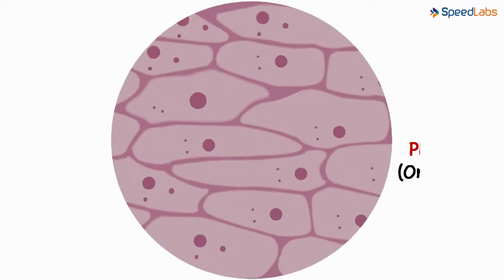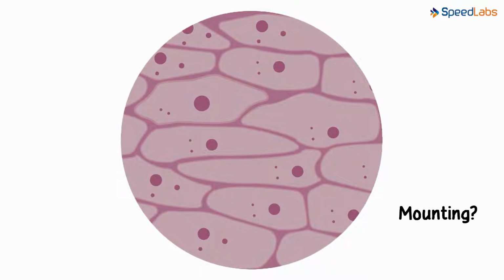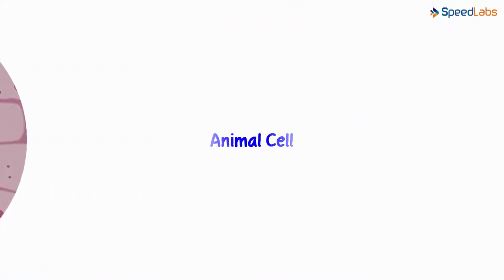In our previous video, we looked at a plant cell. We now know how to mount a microscope slide, don't we? We will now look at an animal cell.